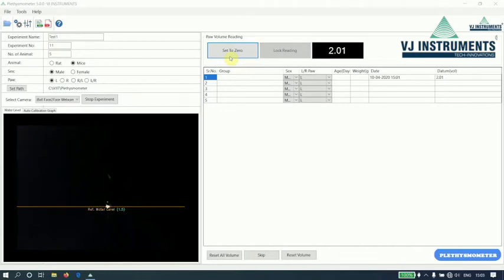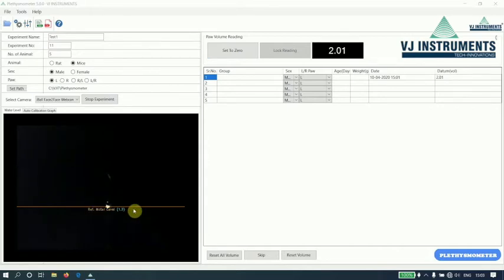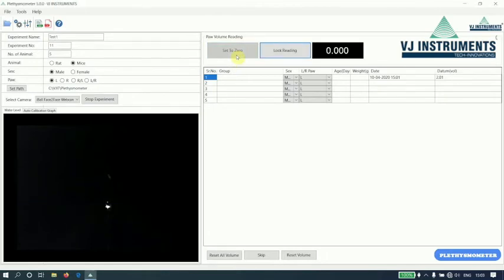Now, remove the cubes inserted in the tube and check the reference water level. It is within plus or minus 5. Now, again, set to 0. Click on Set to 0 button and insert actual paw of the animal.